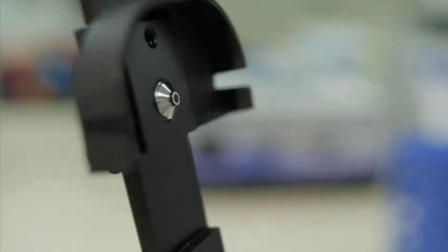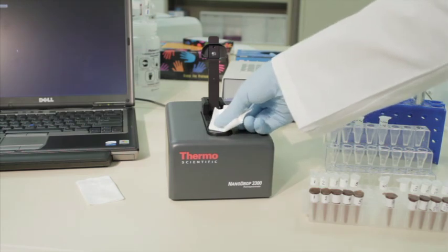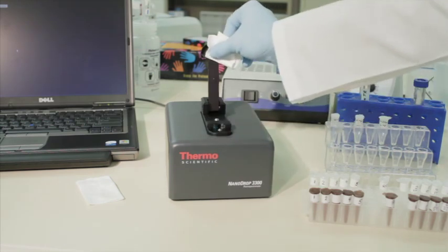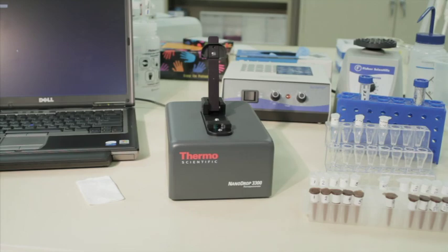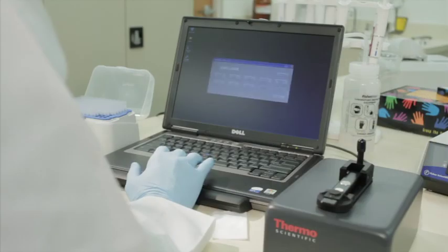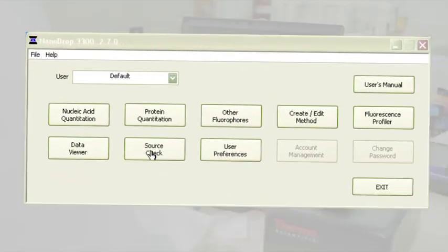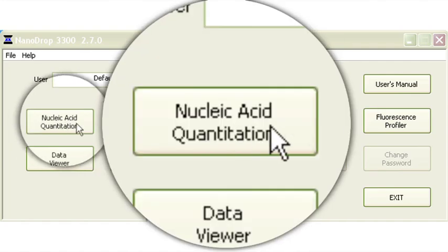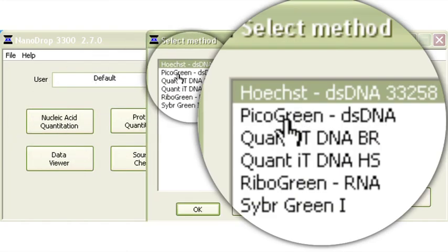Ensure the surfaces are free of lint before proceeding, as lint can exhibit fluorescence in the presence of an excitation source and can interfere with the measurement. Open the instrument software, select the nucleic acids application, and select the pico-green double-stranded DNA option.